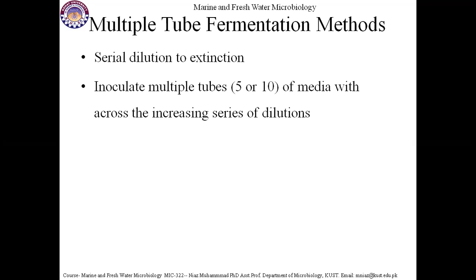Three sets of test tubes. In one set, we are adding 10 ml of the sample. In another set, we are adding 0.1 ml of the sample. And in the third set, we are inoculating 1 ml of the sample.